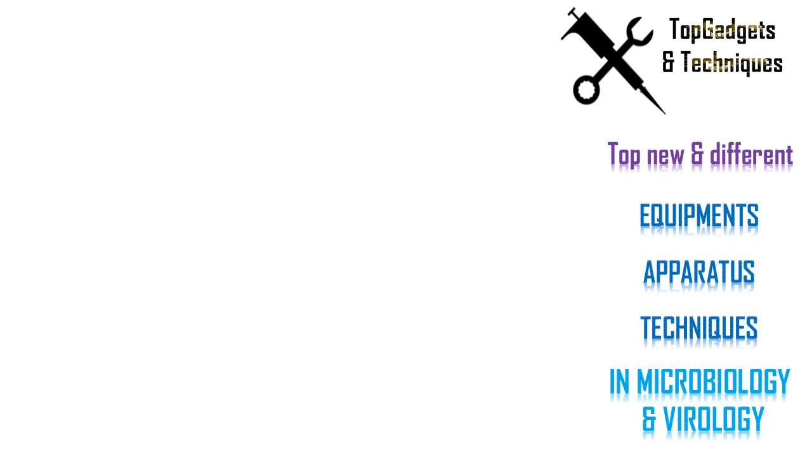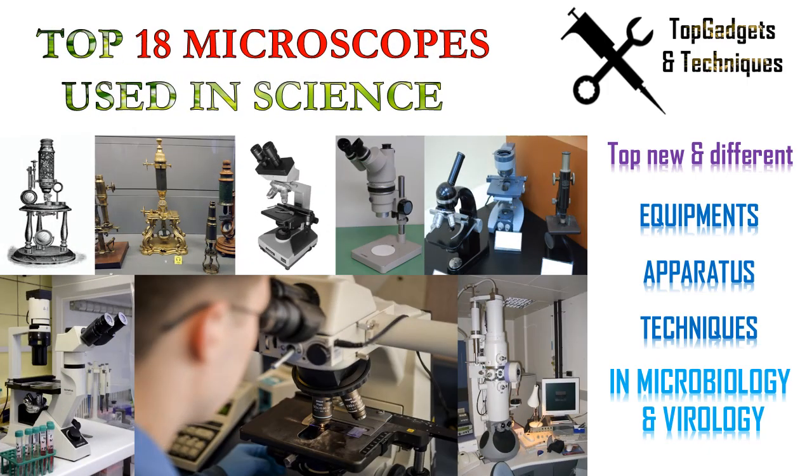And in this video, we introduce you a new playlist, Top Gadgets and Techniques. In this playlist, we will upload videos on top new different equipments, apparatus and techniques used in microbiology and virology. And this is the video of top 18 microscopes used in science or life science.